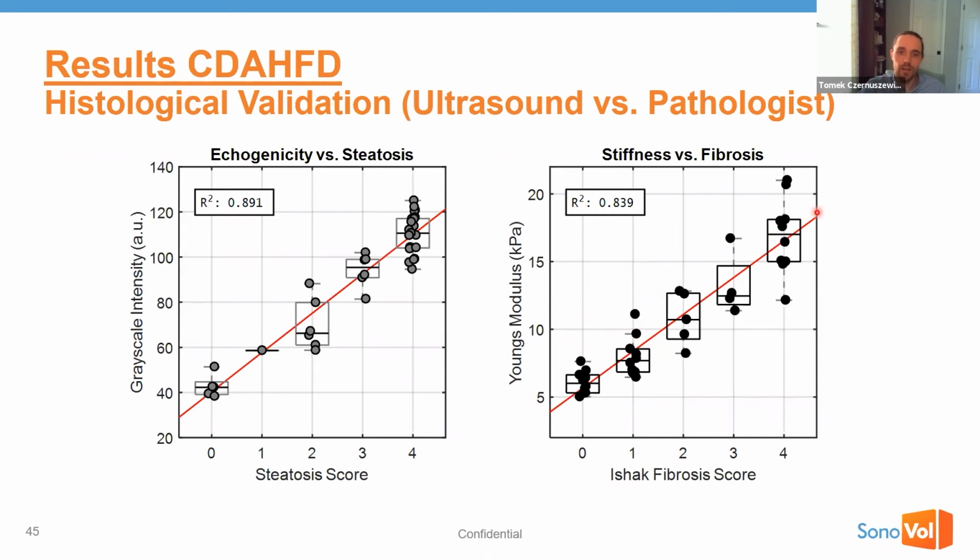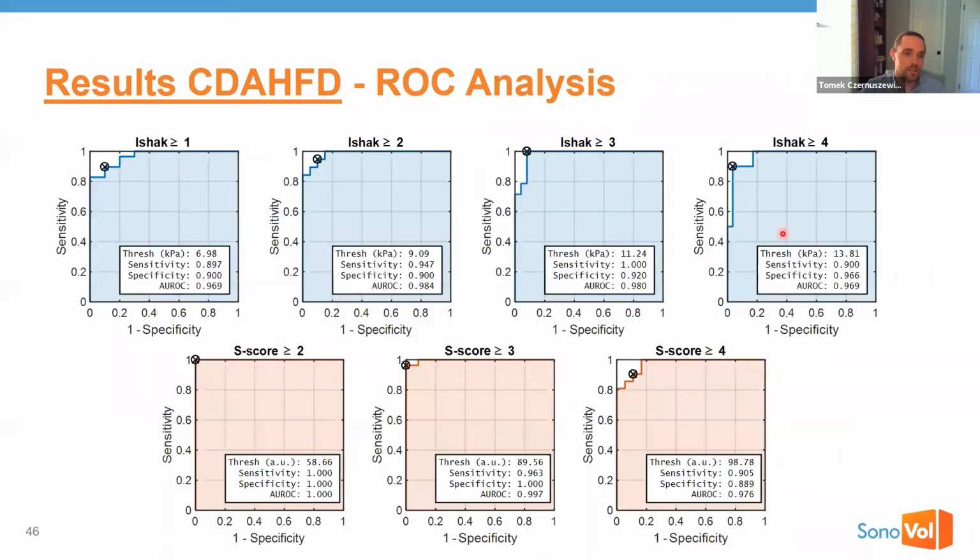But we did have a pretty nice distribution of animals that spanned the 0 to 4 range, the pre-cirrhotic ranges. I performed an ROC analysis to see what our sensitivity and specificity, or classification ability, of the technique is, because ultimately what we'd want to do is use our technology on the front end of a study to sort and select or recruit mice into various arms, right?